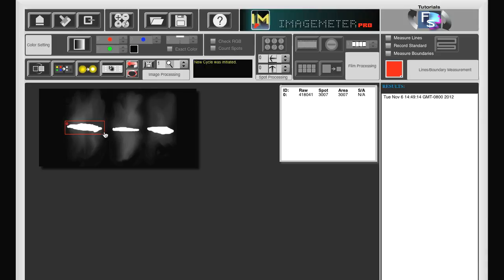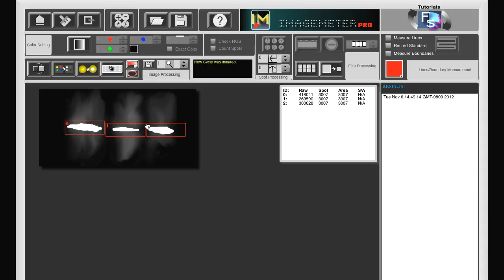Then we position the mouse next to the rectangle and just click. The second rectangle has the same size. We repeat this for the third band. Now we press the calculate button.